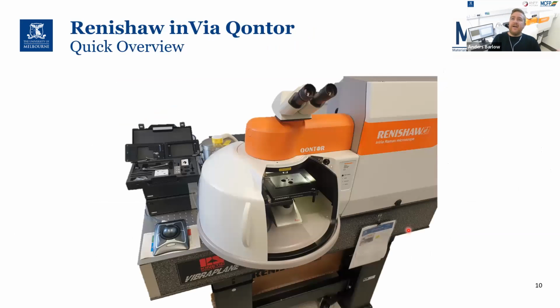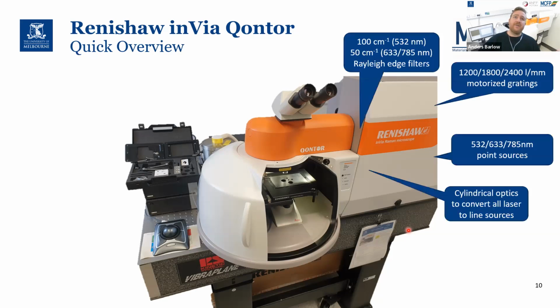So let's now have a quick overview of the Raman instrument at the MCFP. As I said, this is a Renishaw inVia Qontor Raman microscope, and this is quite a well-equipped instrument that we now have. We have multiple laser excitations: 532 nanometer, 633 nanometer, and 785 nanometer excitations.